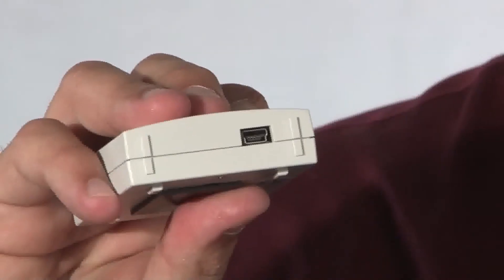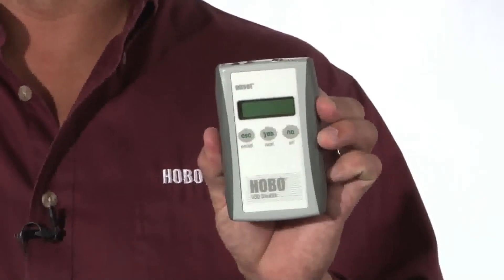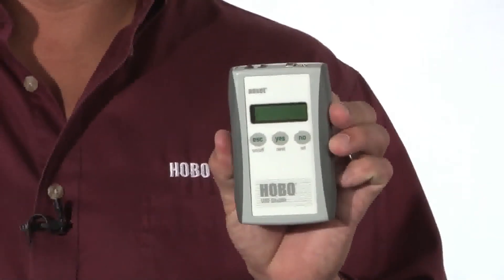There is a USB port on the bottom. It takes roughly about 30 seconds to download this to HoboWare Pro for Windows or the Macintosh. We also offer a shuttle device, part number UDT-1, where you can go out into the field and download and restart your logger.